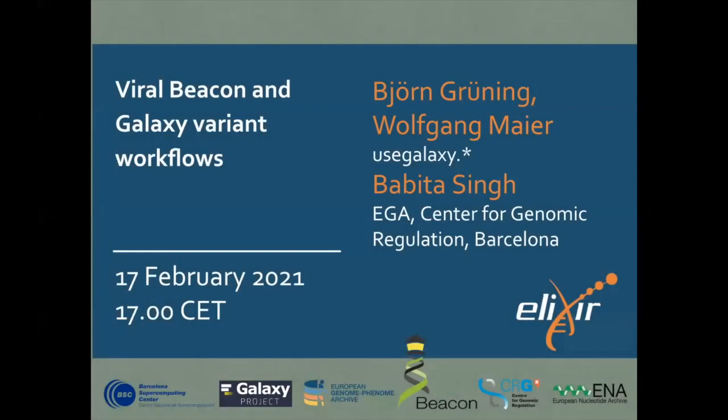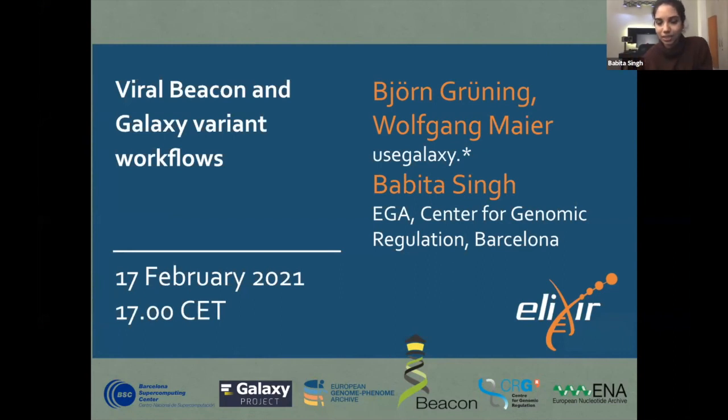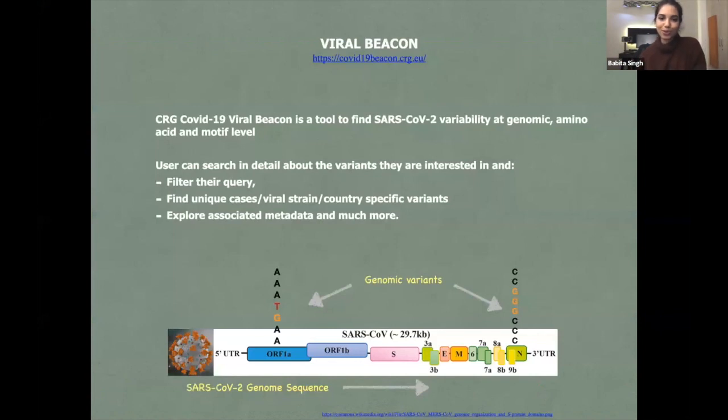Yes, perfect. Okay. Thank you, Wolfgang. It was a really nice presentation, and you described your workflow quite nicely. And I take on from here to describe a bit how we collaborated with the Galaxy team, and they were very helpful, especially in the beginning, to entertain our queries.